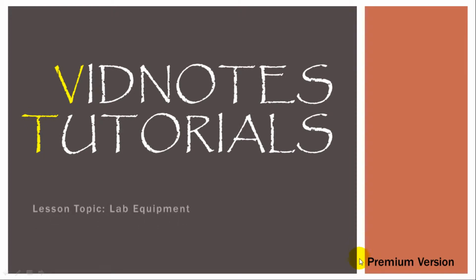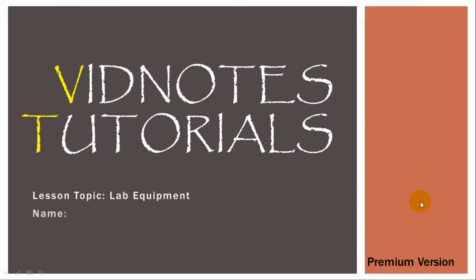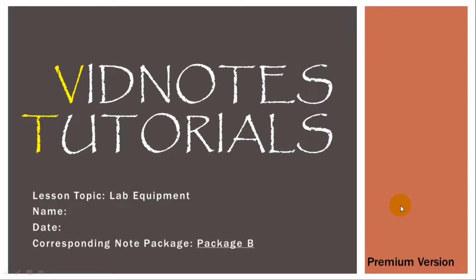Welcome to VidNotes. In today's lesson, we're going to go over lab equipment and just go through the general lab equipment that you'll be using in your science classes. We'll just kind of explain what the purpose for each one is. For today's lesson, you're going to need Note Package B, which you can find on our website under the Notes tab.